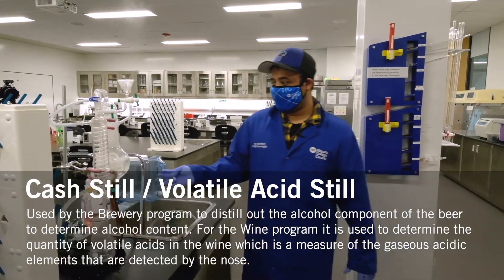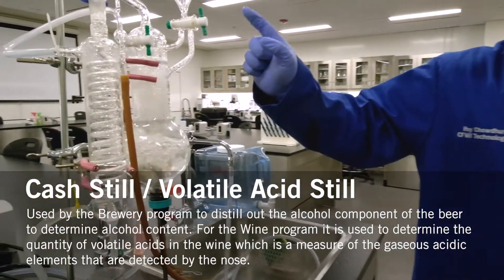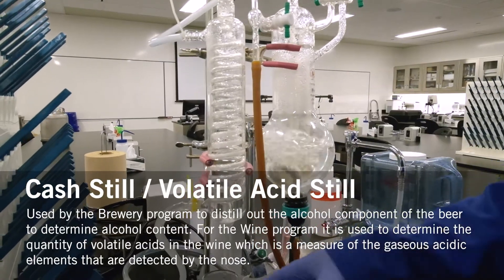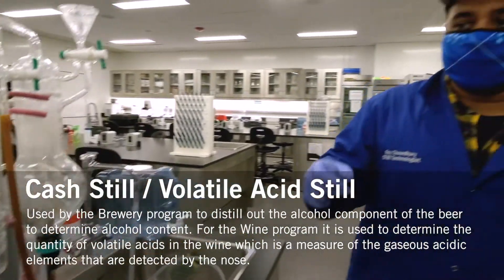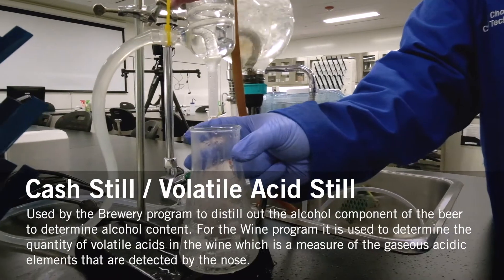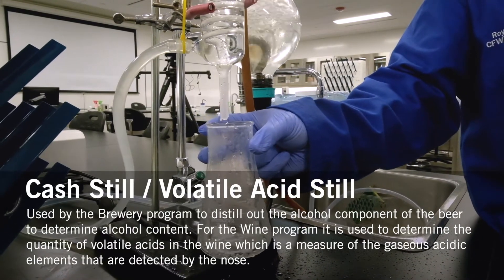This is the Cash still, used by the brew program and the wine program. What it does is — whatever sample you place in the inner chamber — it extracts the compounds and places them in this flask here. As mentioned earlier regarding the titration unit, they use that to determine the amounts present. The compounds being extracted are basically the alcohol percentage present in the sample.